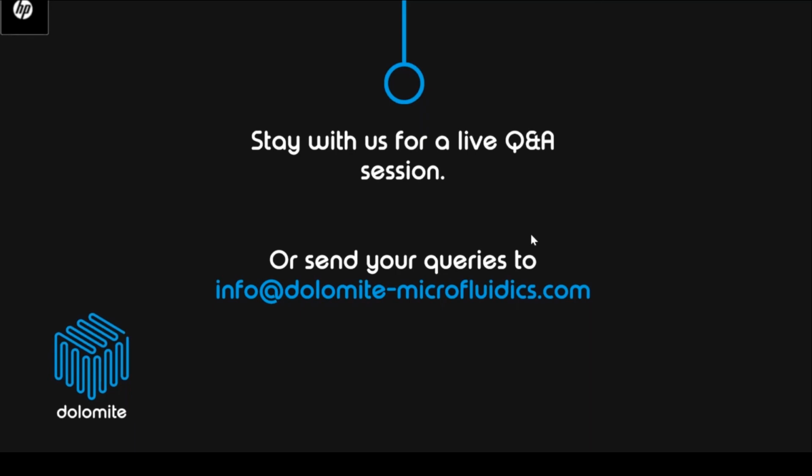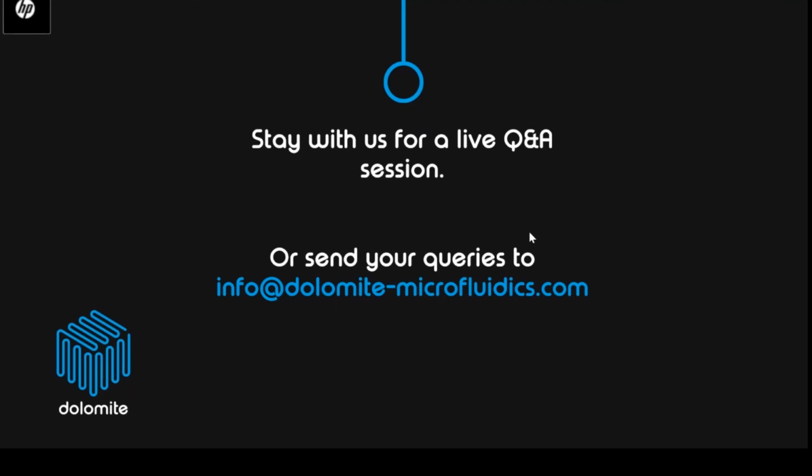Is miscibility of solvents required, or is it also possible to use a mix of miscible and slightly soluble solvents for lipids? Yes, exactly. So some miscibility is required, because in order for the lipid nanoparticles to self-assemble, we require the two phases to mix and be able to have some miscibility to allow your cargo to then get encapsulated. If there was no miscibility at all, your cargo or your API will not be able to get encapsulated, and your lipid nanoparticles will not be able to assemble. So usually the most commonly used solvents are ethanol and the likes of ethanol, or mixtures of these types of solvents, which are somewhat miscible in an aqueous phase. And they work really well as well.